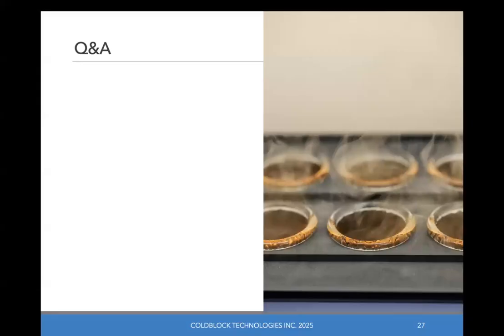So you simply validate your method in-house or according to ISO 17025 requirements. You must demonstrate equivalency to the reference method. And then all that regulators and accrediting bodies really care about is that your method is scientifically defensible, reproducible, and traceable to the CRMs and quality control standards. I hope that answers that question.